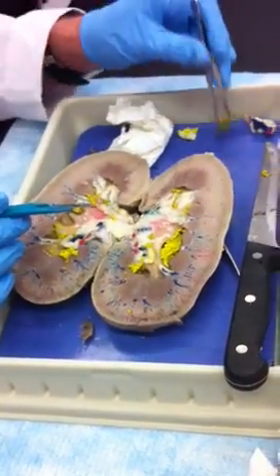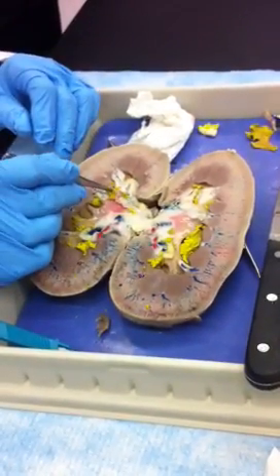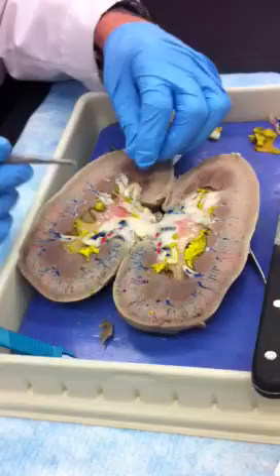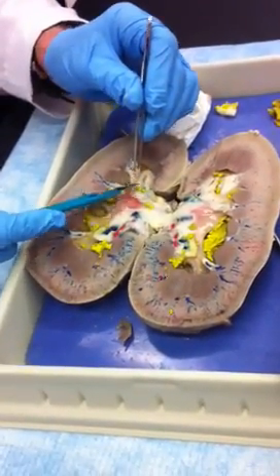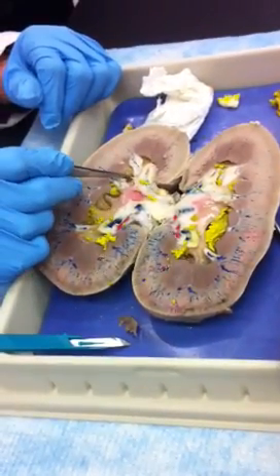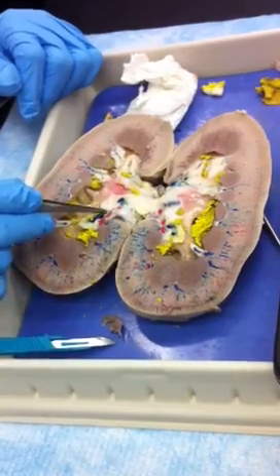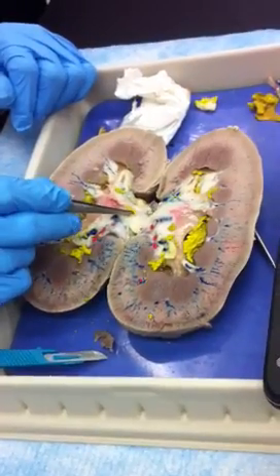I'll just cut that off right there because we'll see the ureter going out. This is actually a minor calyx right there. The latex pretty much made a cast of that space. The minor calyx is the papilla, pyramid. This is a major calyx because it's quite large and collecting from different areas. There's the pelvis, and the ureter.